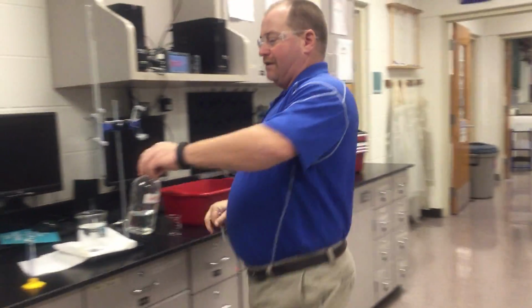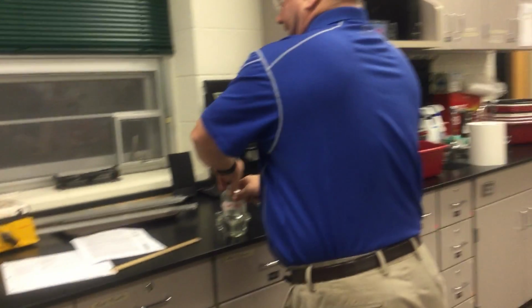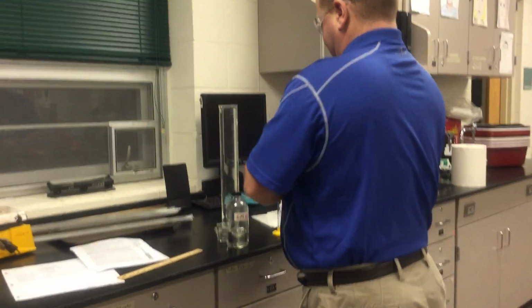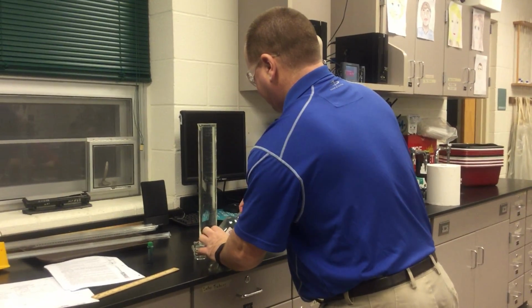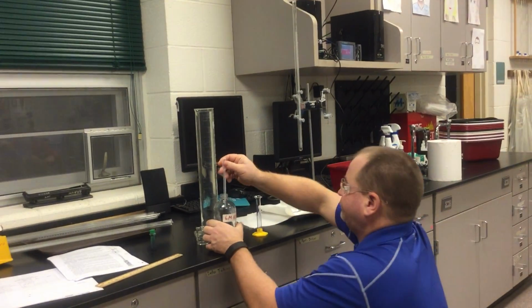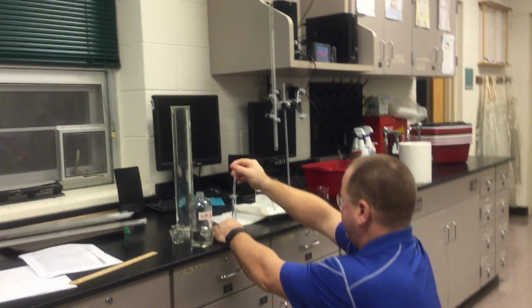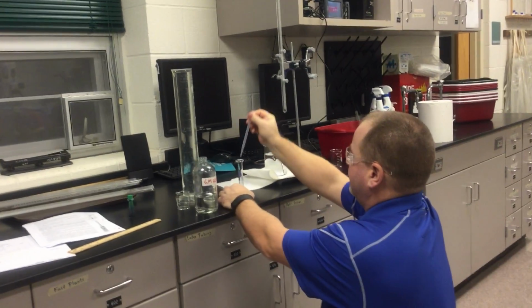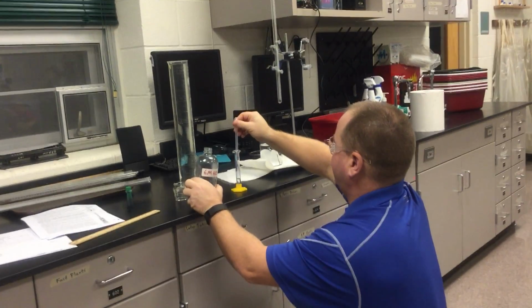It's not going to burn my nose or anything like a more concentrated 12 molar would, but I need to put in 10 milliliters. Notice I got the cap in my hand. It never touches the table. I'm going to need, I think, about 4.5 squirts to get to 10.